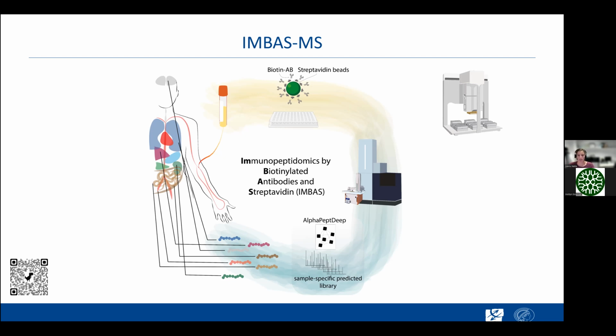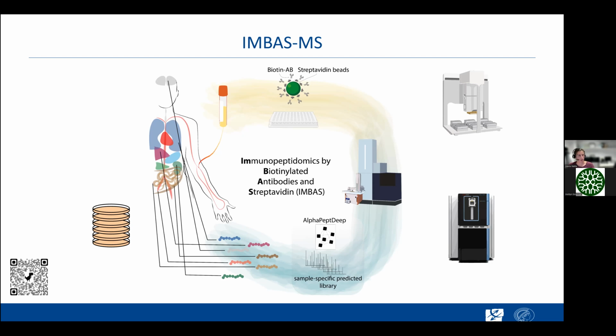What is also nice is that you can also do it with lysates or with tissues. You just have to add the lysis upfront. But you have to do that no matter what kind of immunopeptidomics enrichment workflow you're using. It's really just exchanging the antibody and beads here.